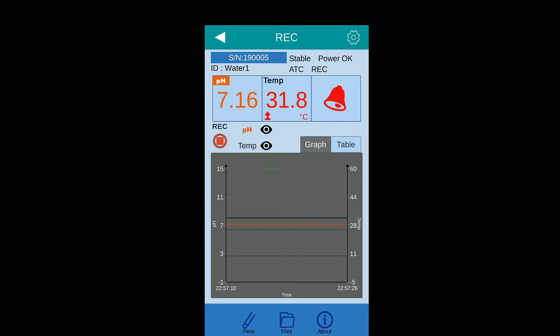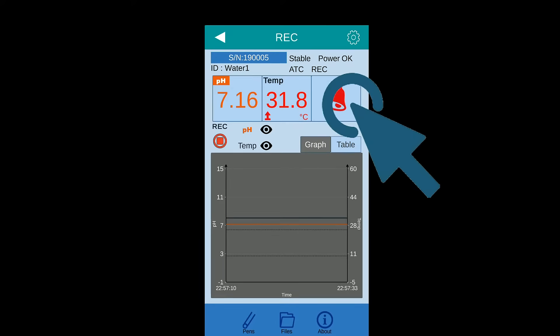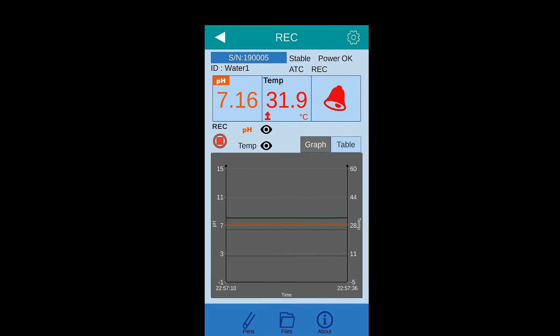While an alarm event is triggered, sound, vibration, bell and arrow icons will all appear on app as reminder. Double-click bell icon to stop sound, vibration and bell. The arrow icon will only disappear while the reading is returned to normal range.